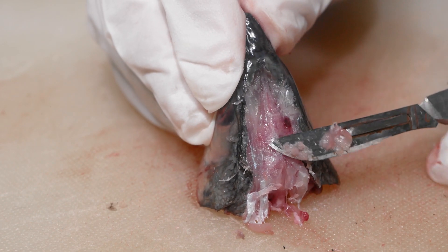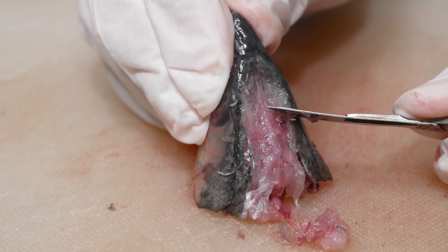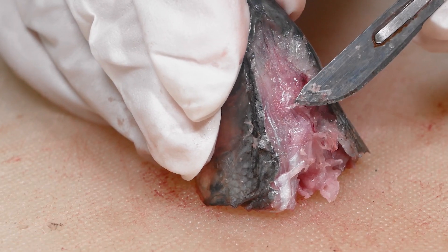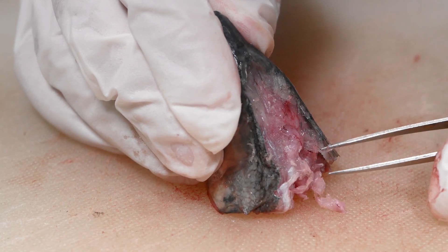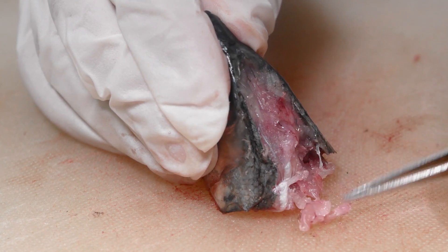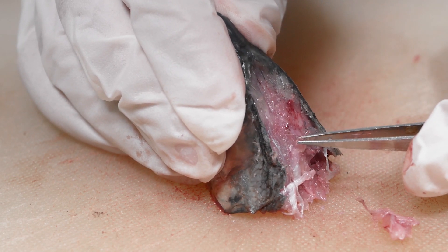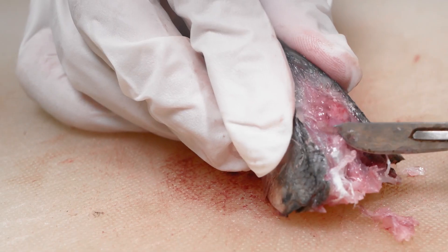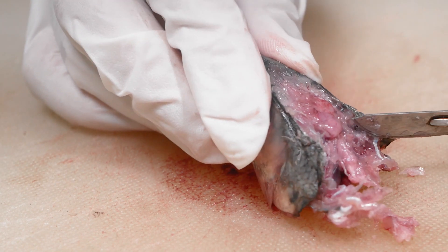Depending on the size of the fish you have, removing the brain can be challenging, and the techniques shown here may not work for your fish — that's okay. The goal is to simply keep the brain intact as much as possible. Carefully break the skull open with your forceps and remove as much of the bone as possible. The trick is to not go too deep — which would slice off the top of the brain — and not too shallow, which would leave the brain still covered by the skull. You may also use a scalpel. Be careful in doing this step to avoid injuring yourself.